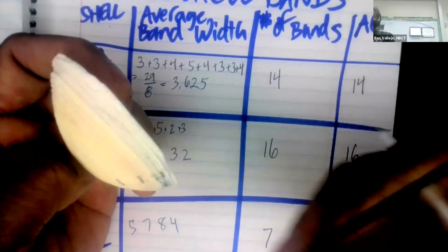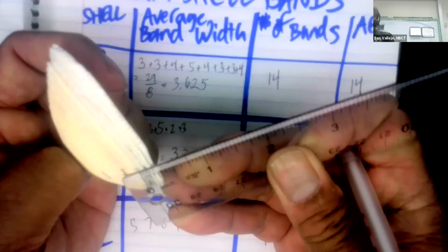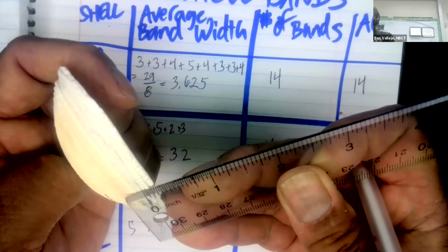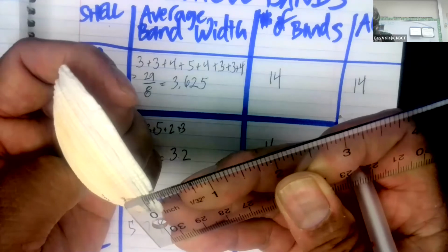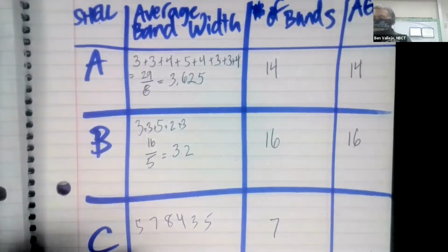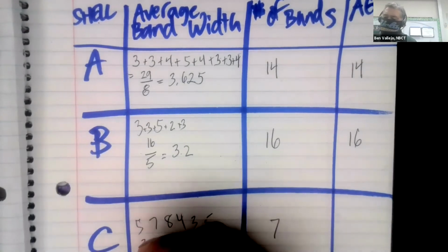And I got 2 other ones that are smaller. That looks like a 3. And that looks like a chip. So maybe, depends where you are, 3 and maybe a 5. So let's look at that one. We have 24 plus 3 is 27. 27, 32 divided by 5.